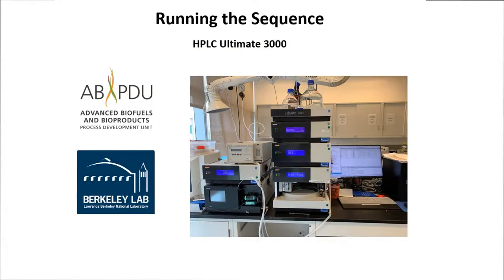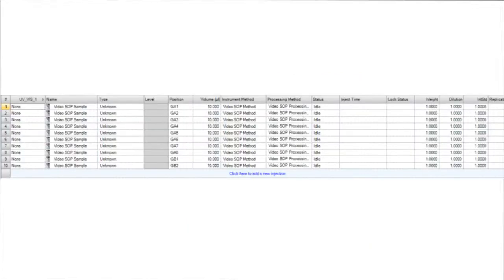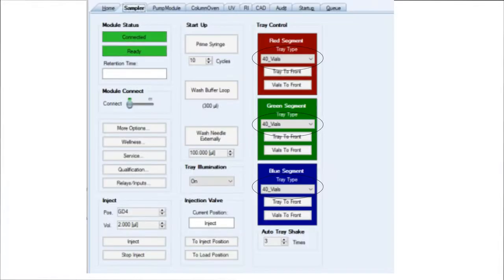Now you have verified the instrument is set up correctly, equilibrated your column, created a sequence, created an instrument method, and prepped your unknown samples, calibration standards, and QC standards. Launch your newly created sequence and modify all sample names and locations to reflect their physical sample name and location in the autosampler. Verify that all parameters match in the sequence table, especially physical location of samples and the correct option of trays before starting the run.